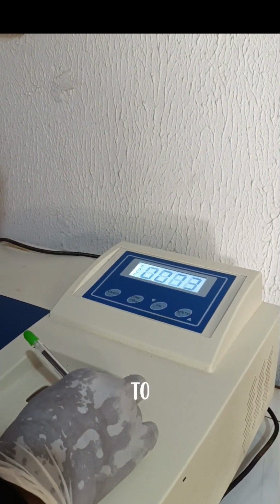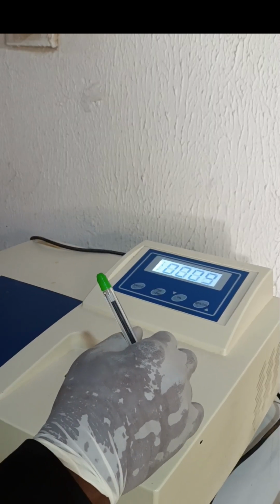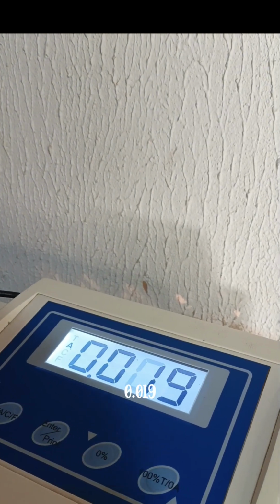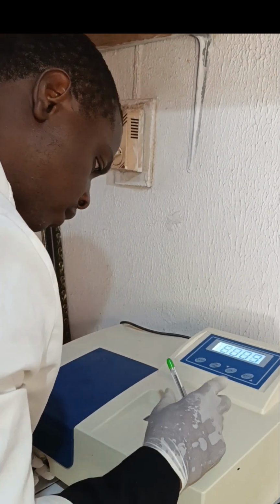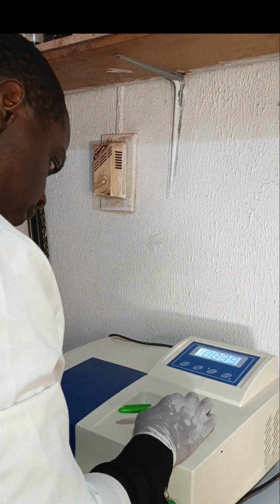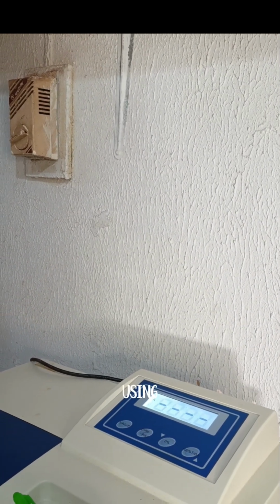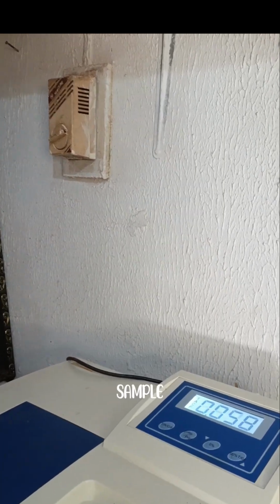Then we change to 410, we got 0.019. 420, and so as we get to 500, we bring the machine to zero using the distilled water, and then we take a reading of the sample.